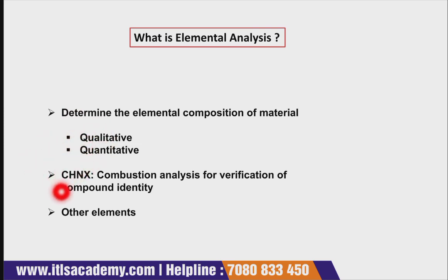Now comes CHNX. CHNX is a combustion analysis for verification of compound identity. So where you want to verify the identity of a particular compound, you can use elemental analysis. Then for different elements, other techniques are used.